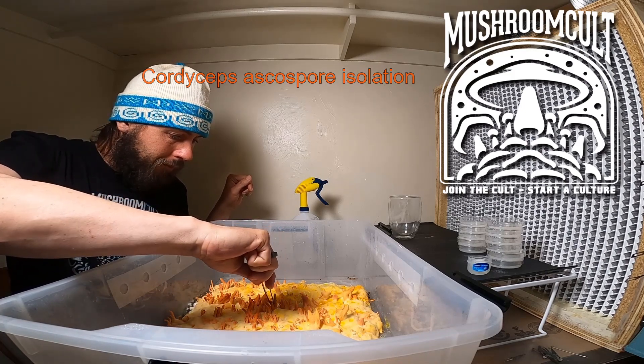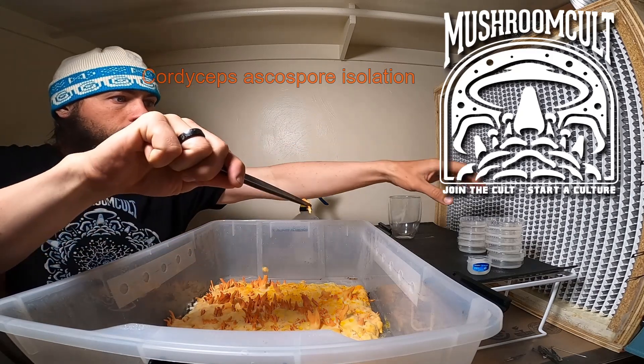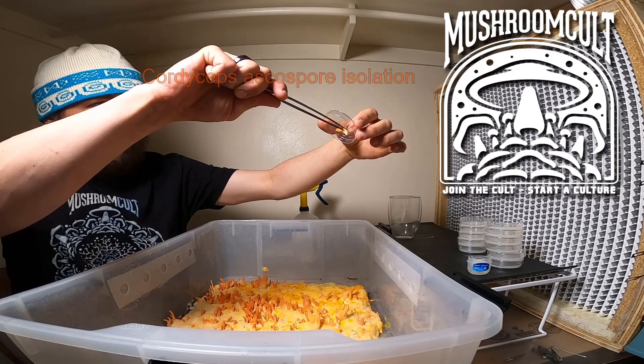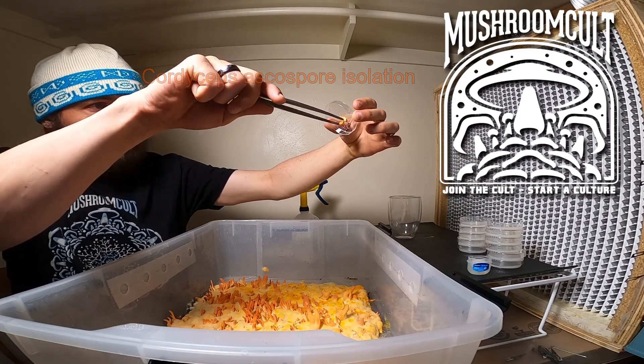This is our first fruiting. We're gonna pluck one of these sporocarps up and attach it to the Vaseline on the lid of a petri dish.